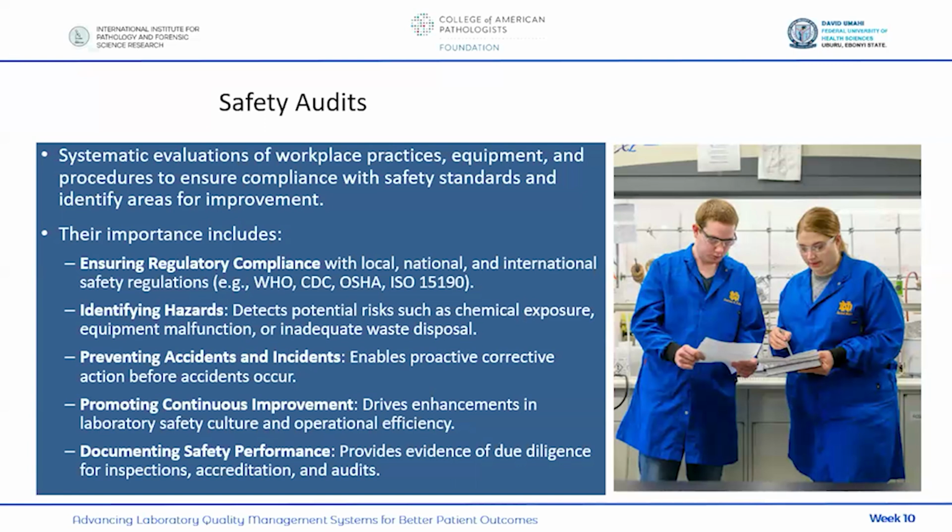And then another importance is documenting safety performance. So it provides evidence of due diligence for inspections, for accreditation, for audits. So it's very important that a laboratory puts in place these safety audits. Okay.